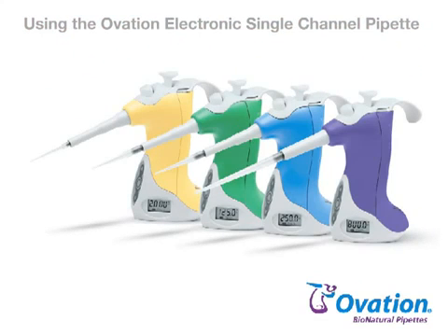The Electronic Single Channel Ovation Bionatural Pipette is an adjustable volume, air displacement, fully electronic motor driven pipette intended to aspirate and dispense precise fluid volumes. Models in both left and right handed configurations are available to cover liquid dispensing needs between 0.5 and 1250 microliters.